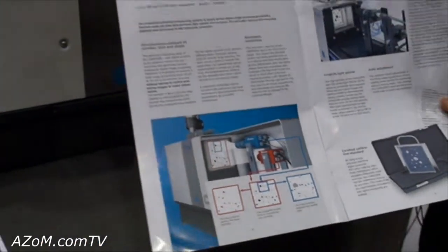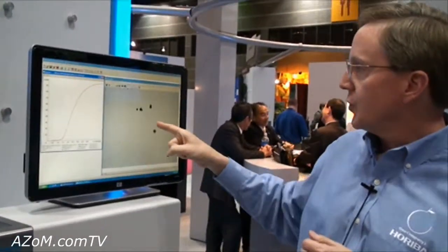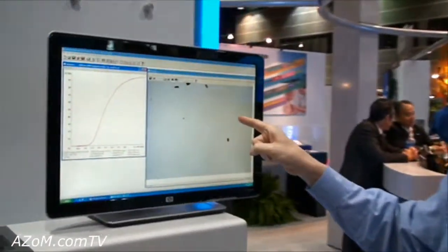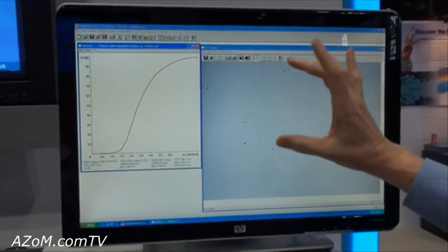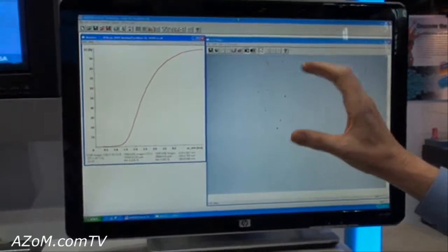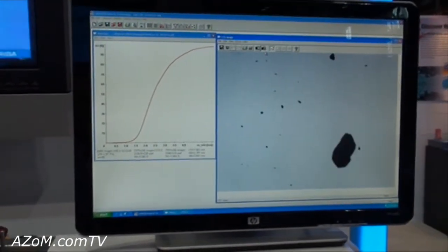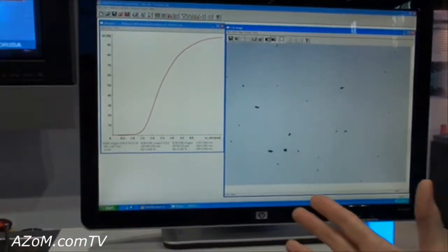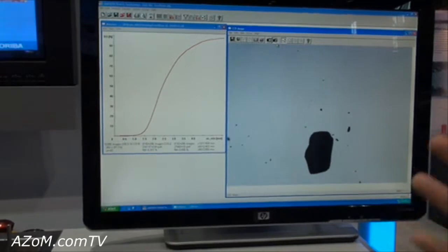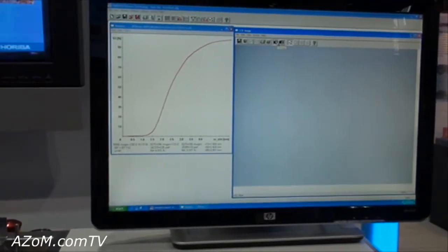So here we're performing the measurements using these two cameras, which is a patented system. And again, we're going to take images, separate the particles from the background, process those images. You can see the images on the camera here as they're being processed. So as they're falling in front of the cameras, we're taking these images and assigning size and shape values to each of those particles as they fall through the system. So this is a system giving us size and shape information, in this case of granular material. And this has been used in many different applications where we are interested in particle size, particle shape.